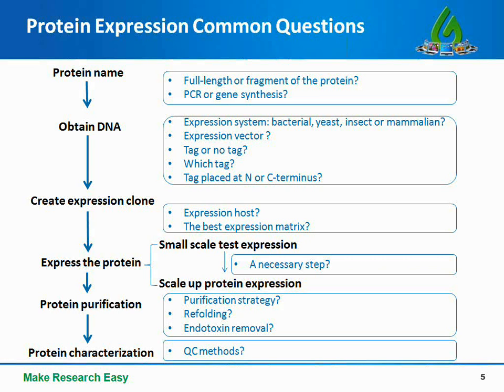You also need to choose purification methods and the protein refolding strategies if needed, as well as the desired endotoxin level in the sample. Once you obtained your purified protein, how would you characterize it to make sure it's the right one? So many questions and so many decision points.